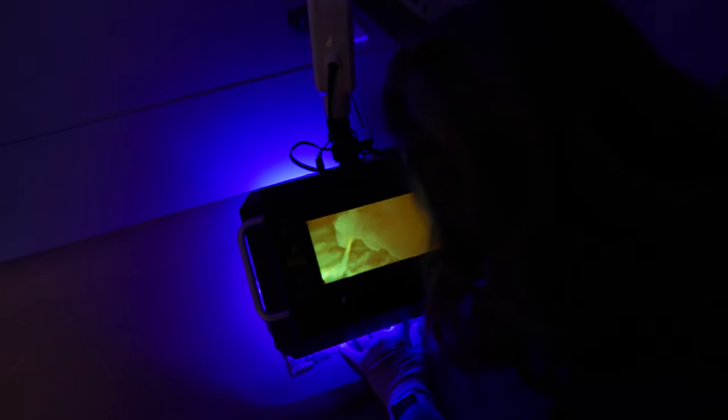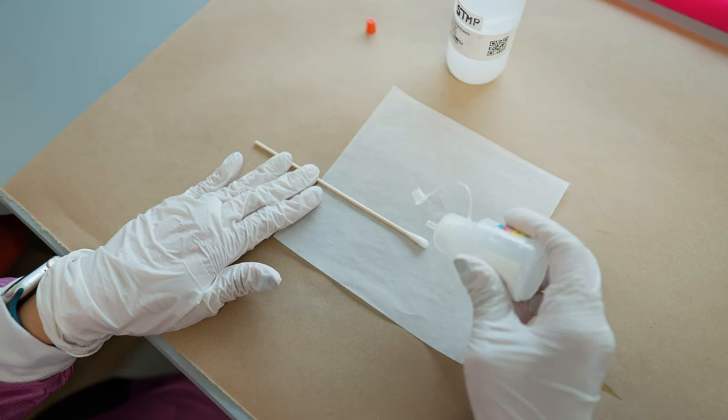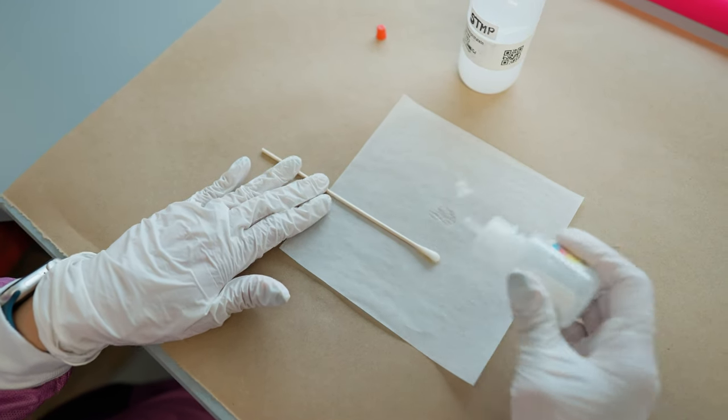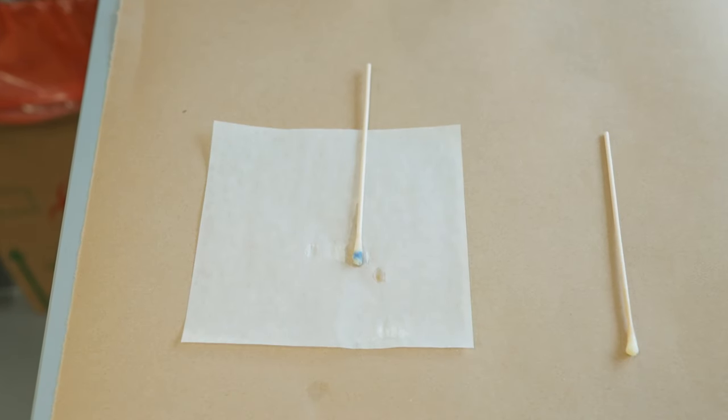After the alternate light source, the swabbing of the stain is then tested with STMP reagent. A blue color change indicates a presumptive positive result for seminal fluid.